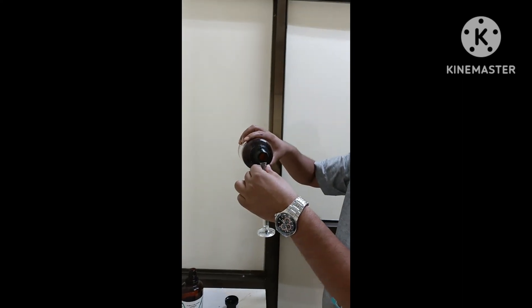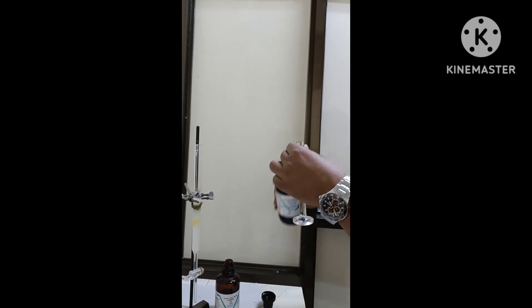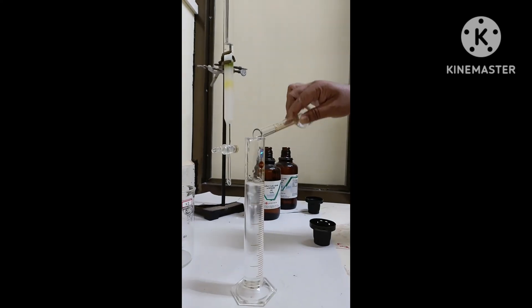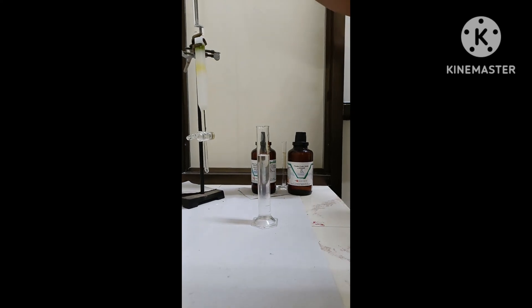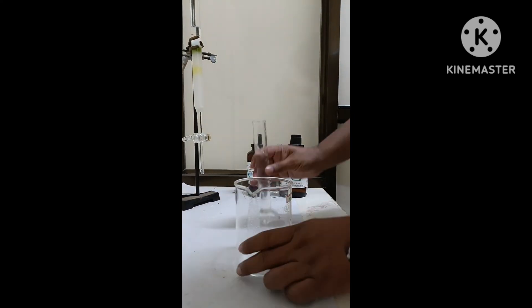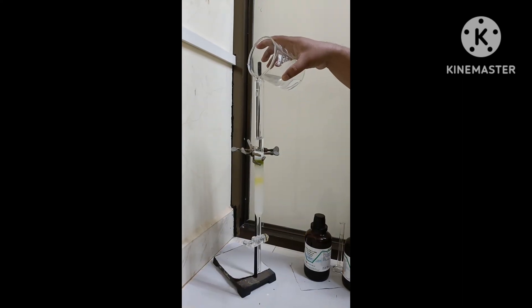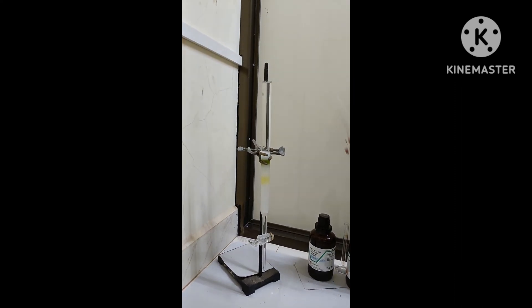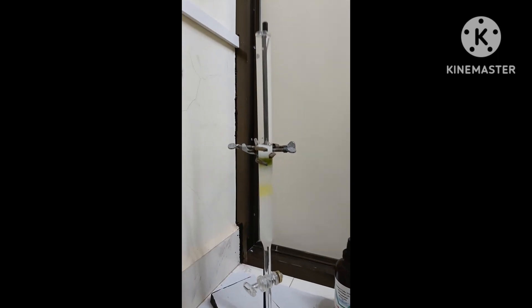As we are eluting with the n-hexane only, now we can add a little amount of acetone. I added 10 ml of acetone in 90 ml of n-hexane, so we are increasing the polarity and then it will move faster. Once you collect the beta carotene in the test tube, then again you can increase the polarity so that the chlorophyll pigments can elute out from the column. This is how you can separate the beta carotene and chlorophyll pigments using simple column chromatography.